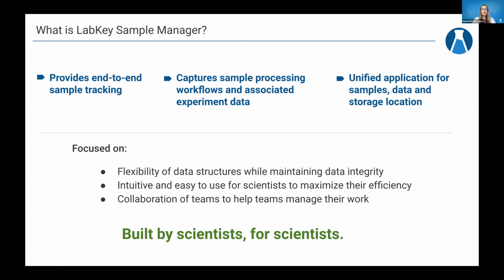So Sample Manager is a cloud-based sample management tool that provides end-to-end sample tracking. And our workflow and assay features really allow for capturing sample processing workflows and associated assay data with those. It really is a unified application for samples, data, and their storage location, so where they might be in the lab at any given time.